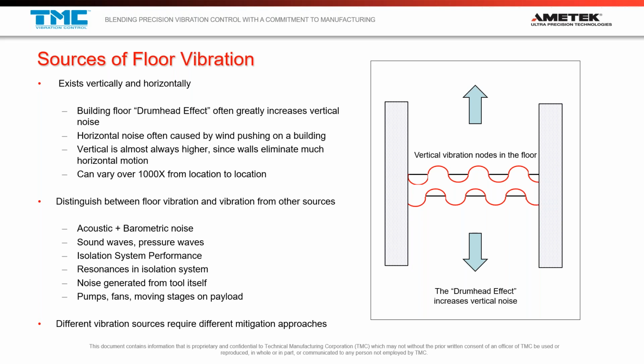Another good example of a 2 hertz resonance is your car springs. You can go to the bumper of your car and drive your car at roughly 2 hertz. It's not going to go up and down a lot, because it's highly damped by the fluid in your shocks, but you will still have that resonant frequency, and you could push it and drive it at that resonance. Instruments themselves also generate their own noise. We see a lot of pumps and fans, and even umbilicals and cables, all part of the system, that are going to generate their own noise.